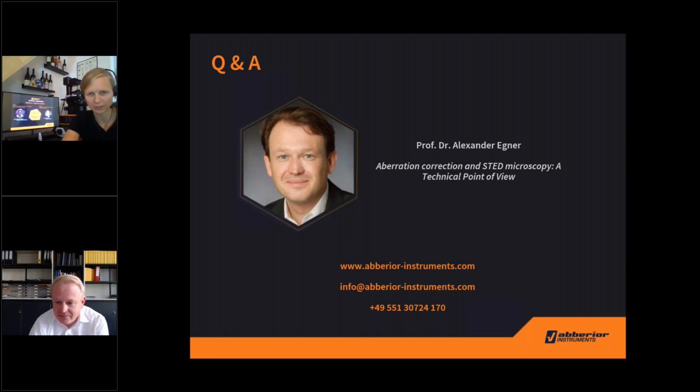I understand that it's faster than image metrics based because you don't need to wait for the whole image before correcting. How does the number of test corrections that you need compare to image metrics based? Is it the same? Yeah, so actually it's a metric, and like also the other methods, we always have to wiggle through the aberrations. So the number of aberrations we have to test are the same.